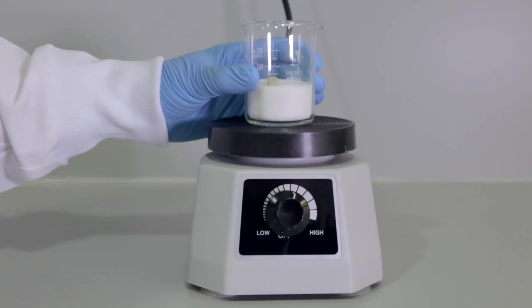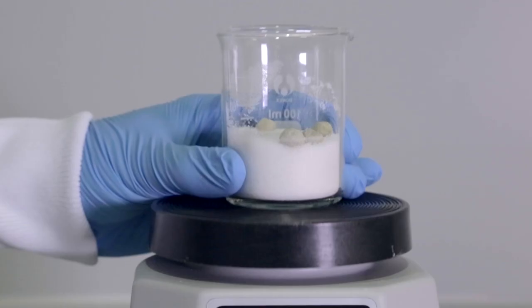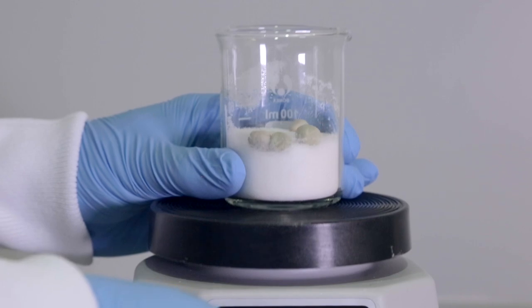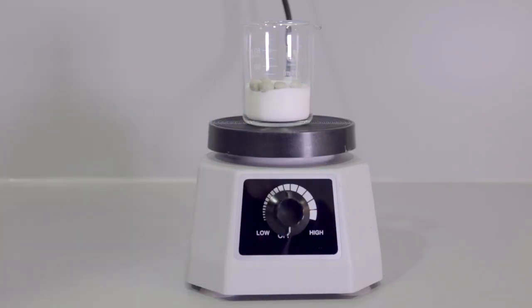When subjected to vibration, the particles will naturally reorganize themselves with the larger particles at the top and the smaller particles at the bottom, as a consequence of the powder bed becoming temporarily dilated and the smaller particles falling below the larger particles.